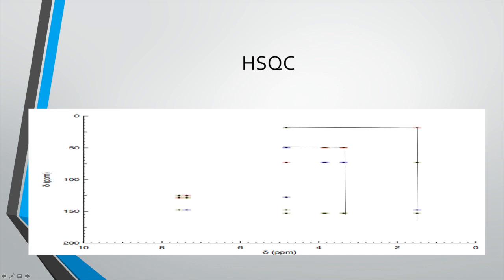For the HSQC, this gives us information about the connectivity between carbons and the protons.